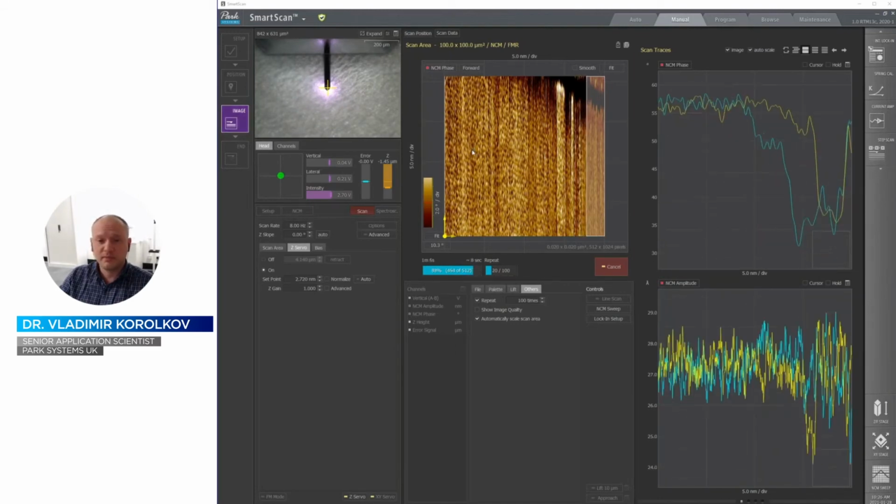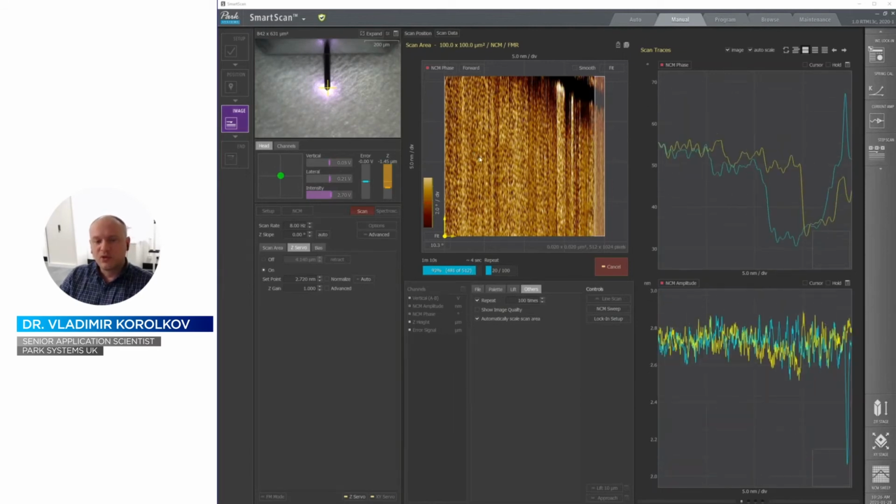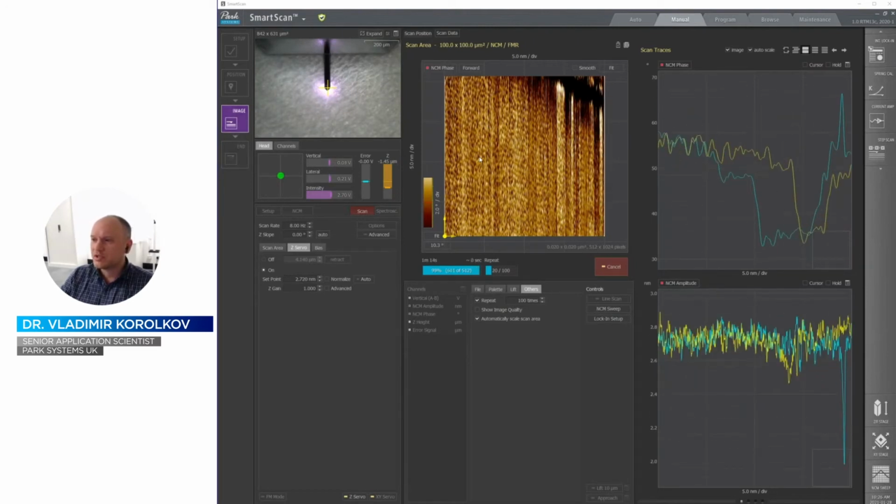and we measure them quite nicely. Of course, when it comes to getting images for publications, you might need to have a bit better quality depending on what journal you want to send it to, and that requires some image optimization.